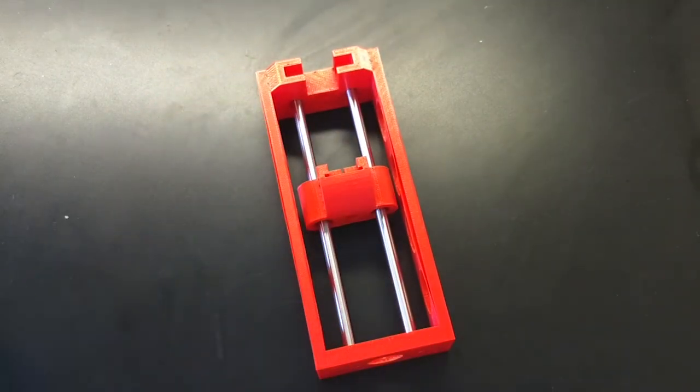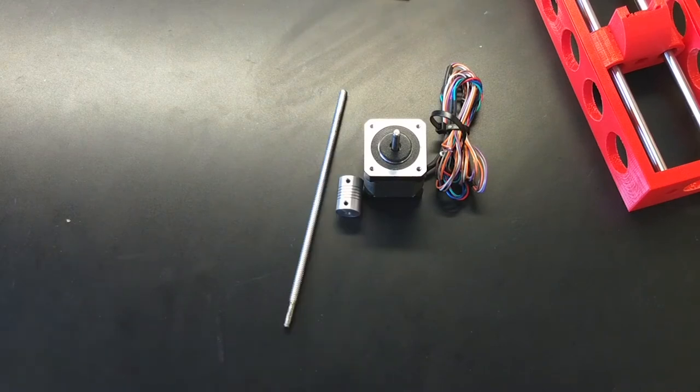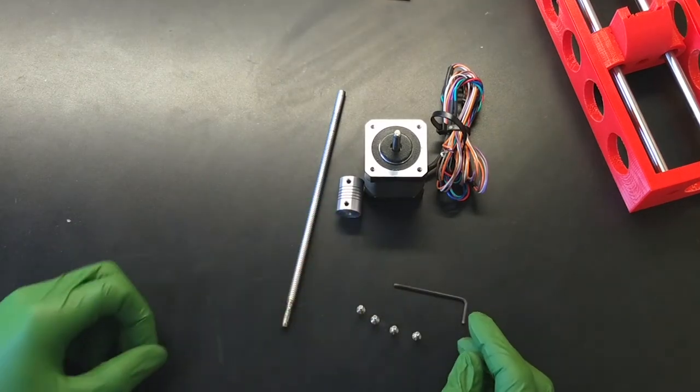Let's get the drivetrain assembled. Get the motor, the flex coupler, threaded rod, allen wrench, and the M3 flat head screws.